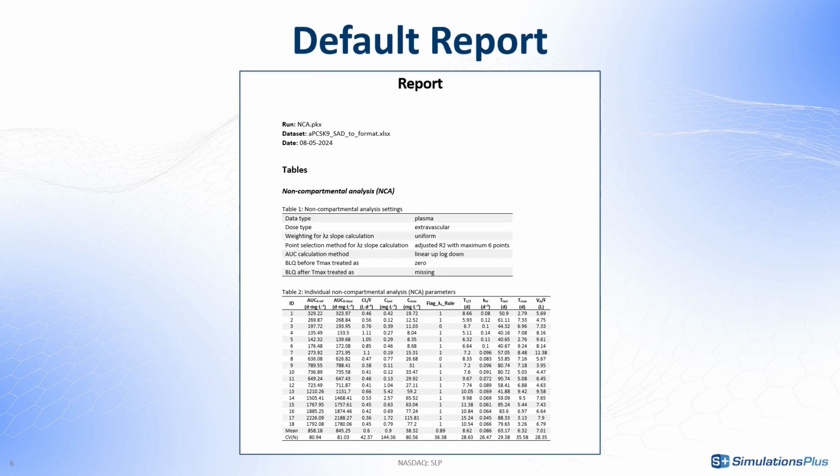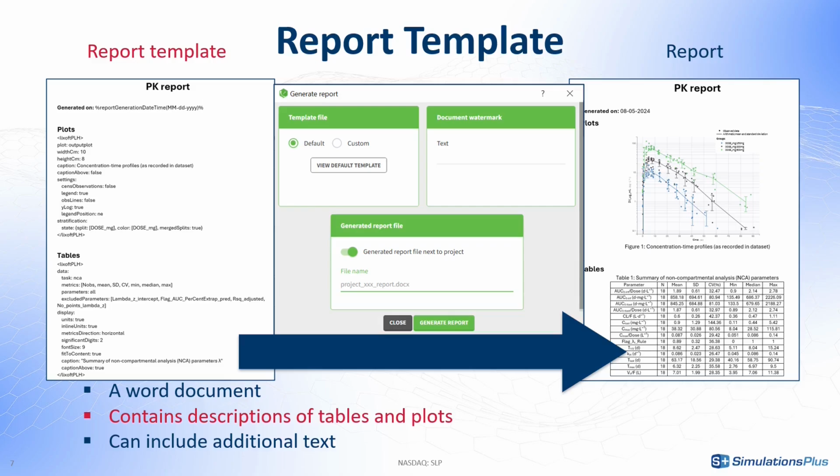How did PKanalix create this document? The mechanism behind the automated report feature is based on templates. A template is a Word docx file that contains and specifies the placement and layout of an object, here tables and plots, in a document.